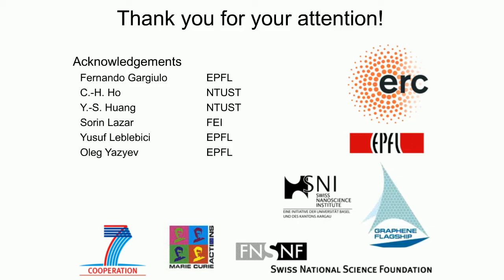If you're growing these materials on a substrate and that substrate is effectively floating, or your 2D material is floating on top of that substrate, then yes, you're going to get a big offset due to that material. If, however, you're mounting it like Andras did, where he's putting these electrodes in, and he has complete control over the material itself, then in that case, it's not going to directly affect it.